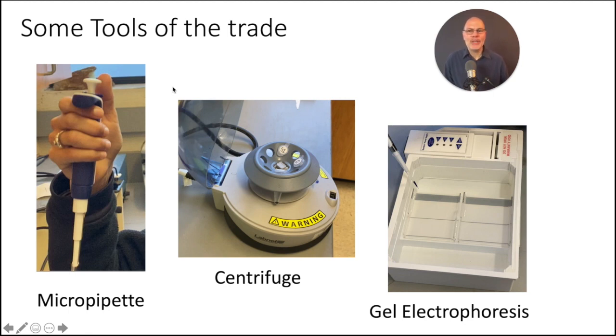You can pick that up. You can move it around. And so that's one thing that happens in this lab, and it happens with this device. That's called a micropipette. You also need to mix these liquids and spin them down, and you do that using what's called a centrifuge, a microcentrifuge. These are actually little microtubes. They hold small quantities of liquid, and you can move them around.